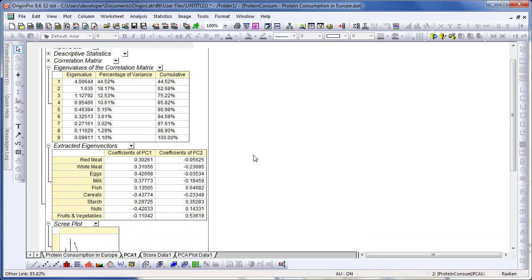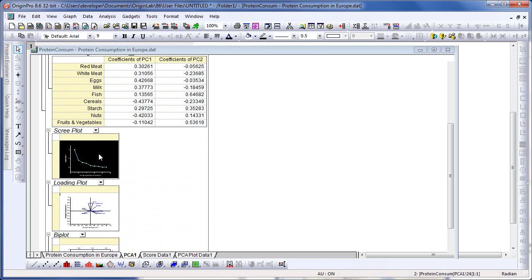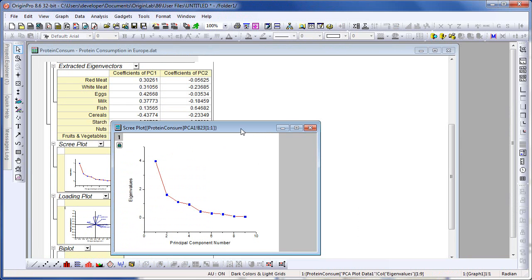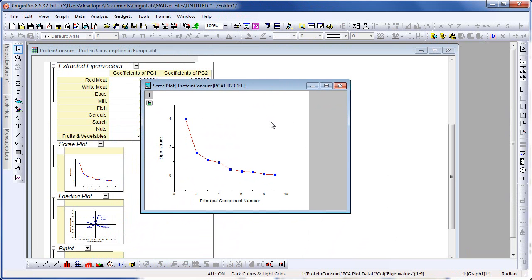Let's scroll down the report sheet and look at the scree plot. I can click on it and double click to open up that embedded graph window for a larger view. Looking at this graph, you can get a visual indication of how many principal components to consider. The fourth point can be considered the elbow point, indicating we need to consider only four principal components.